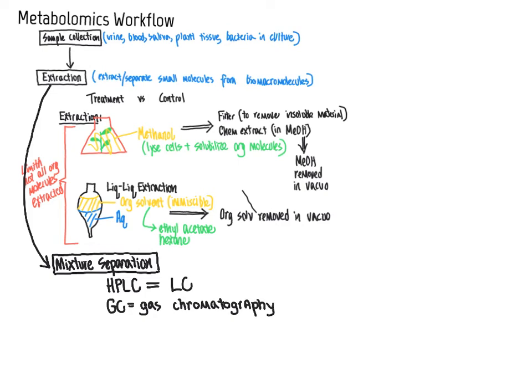Gas chromatography is becoming less and less prevalent in the world of metabolomics because gas chromatography is more limited in its applicability. Gas chromatography separates compounds that are present in the gaseous state, and as a result requires that compounds be sufficiently volatile in order to transition to the gaseous state during the separation process, because the compounds are separating based on their different boiling points, the temperature at which they transition from liquid to gas.